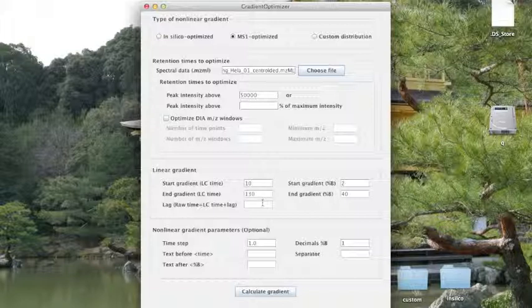For this dataset, this value was -6.9. It can be either a negative or a positive value depending on your settings and your instruments. And I encourage you once more to read this article to learn more about what this value means and how you can estimate it for your own system.